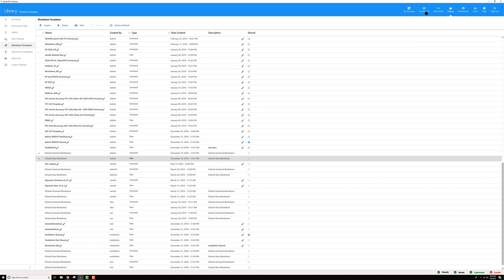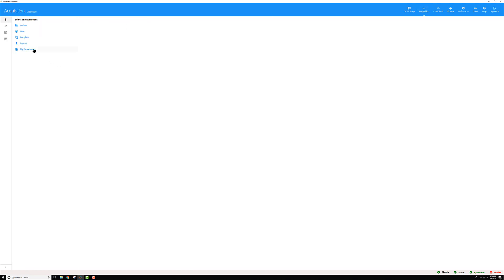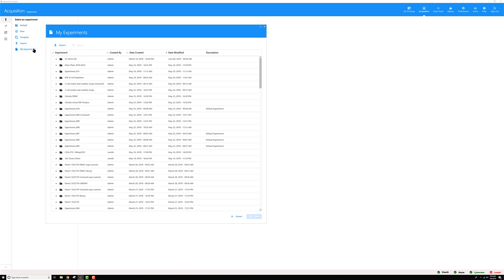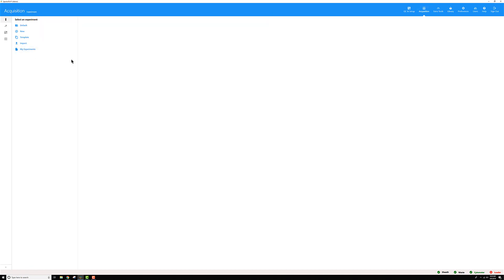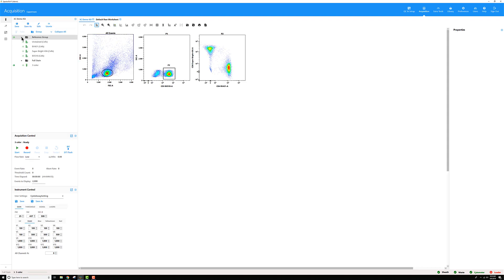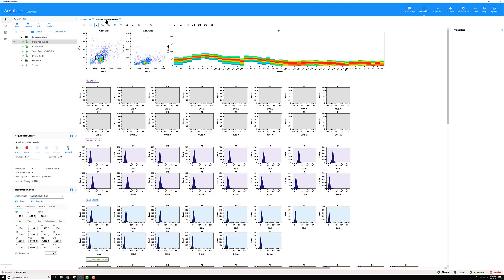Now if I go back to that same experiment and open it from my experiments, double click to open, I'm back here. Let me go and look at my default raw worksheet and now you can see it's much cleaner.